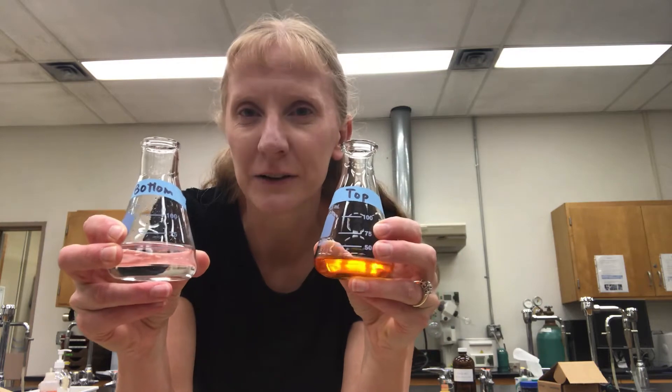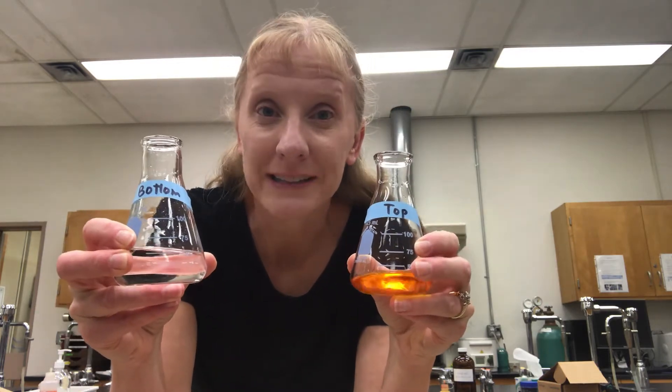Hi everyone, my name is Lisa Nichols and in this video I'm going to show you how to do multiple extractions. This is a follow-up from a previous video where I did a single extraction — I took a pink methyl red aqueous solution and extracted it into ethyl acetate using a separatory funnel, and was able to get two different layers: a top organic layer and a bottom aqueous layer.